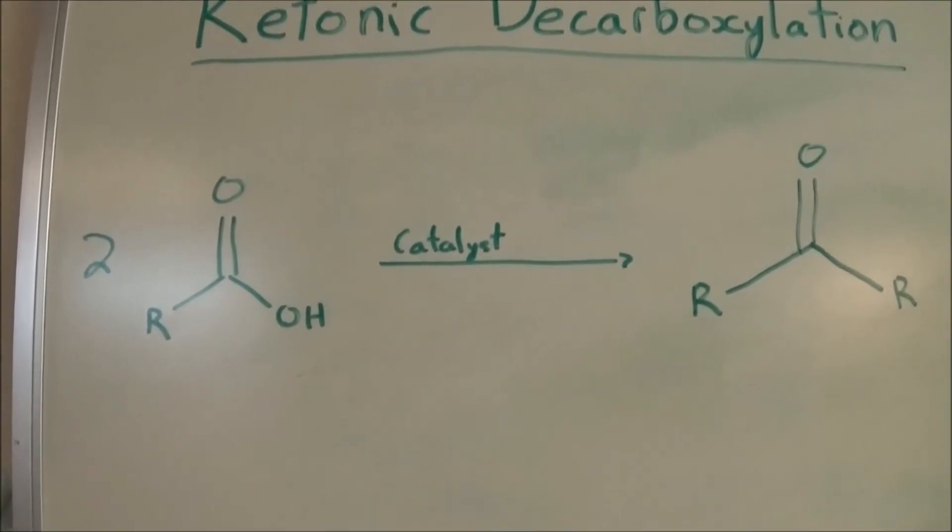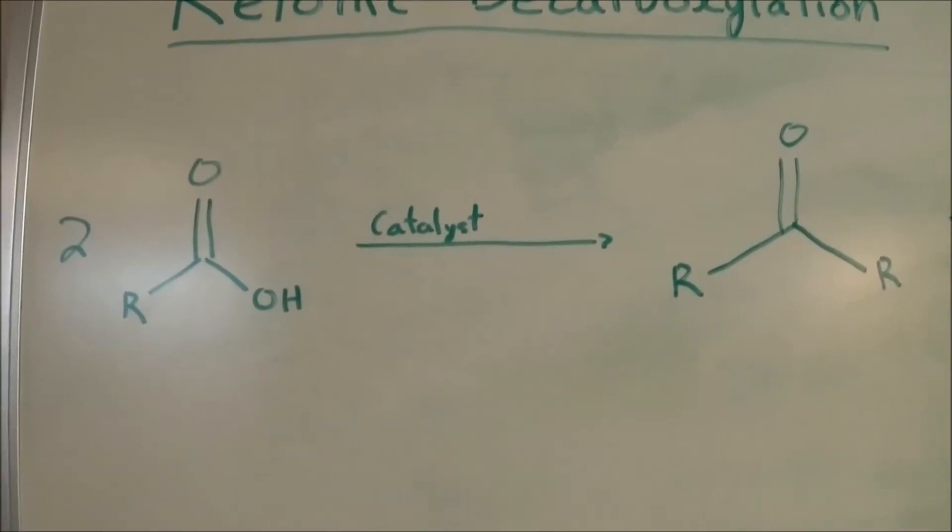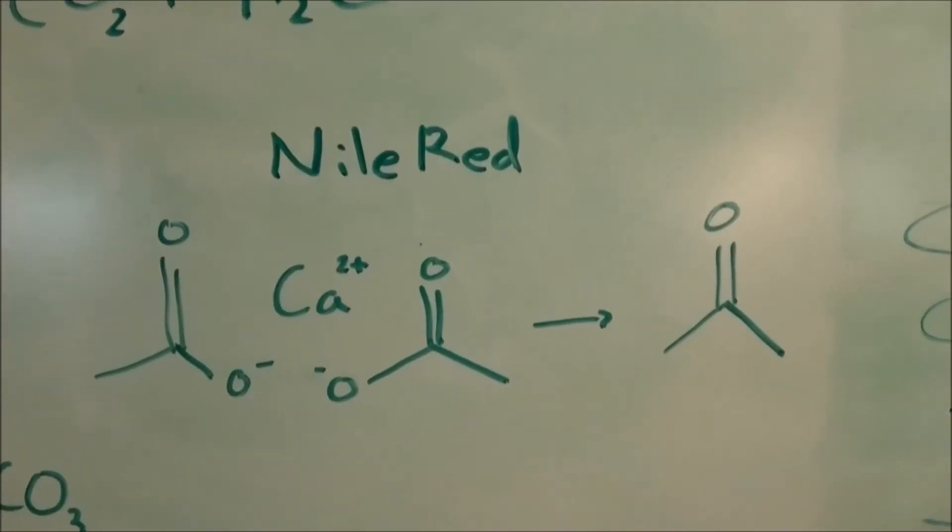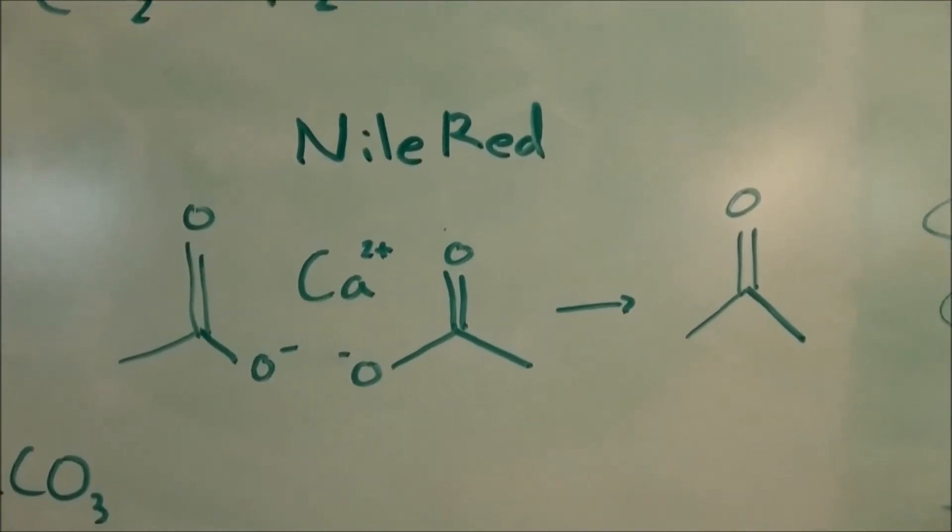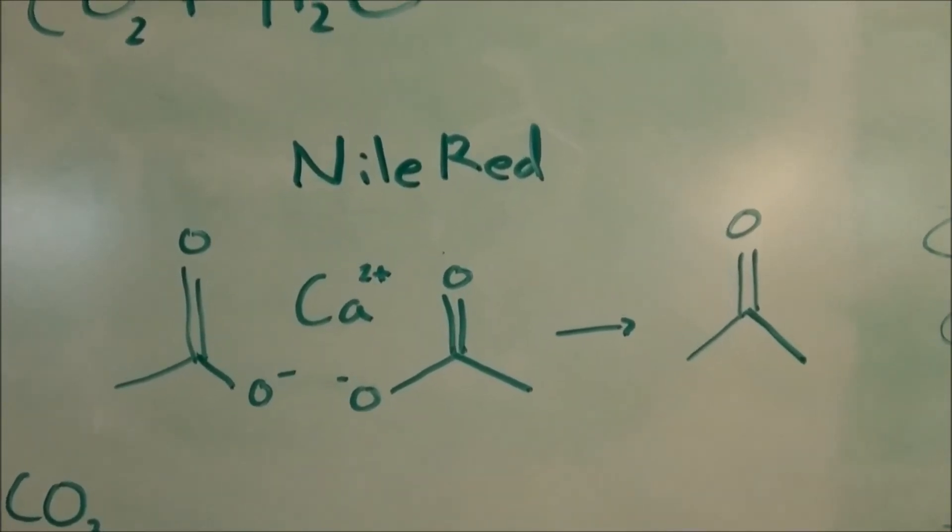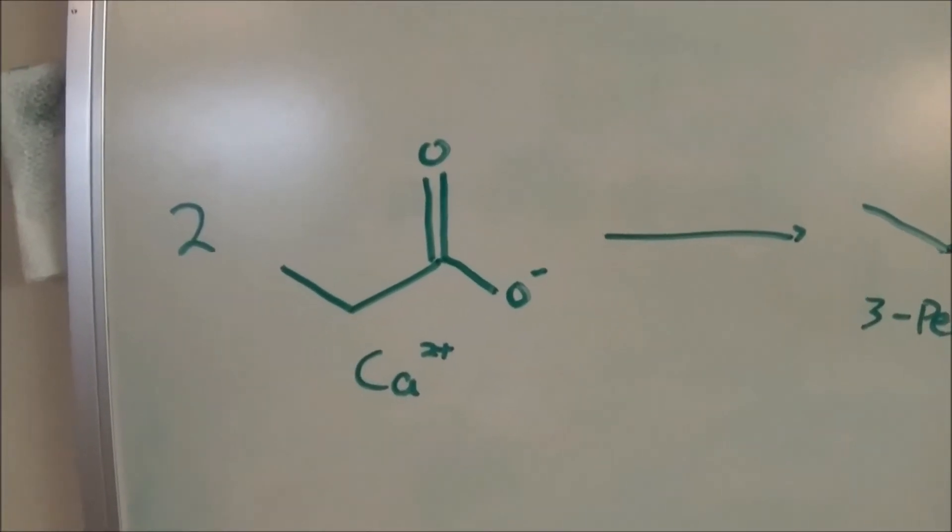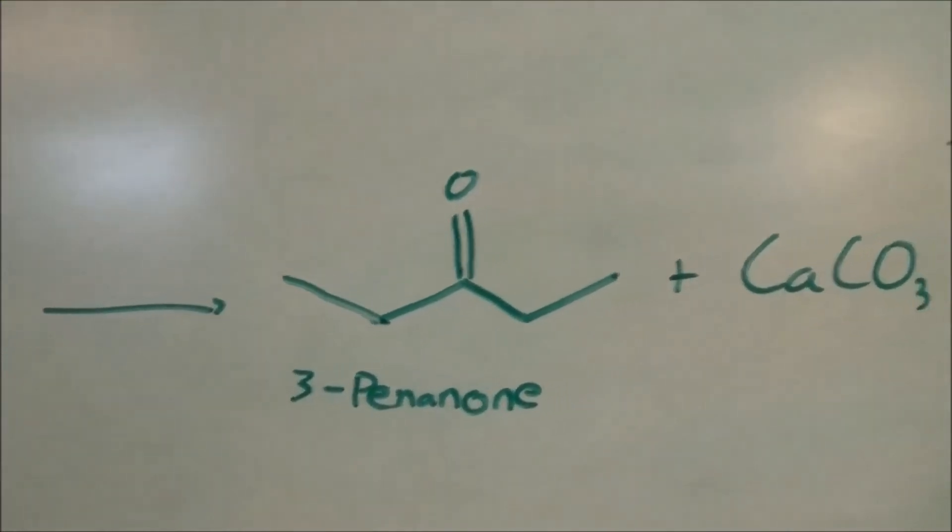It just so happens that this reaction will also take place with the salts of carboxylic acids. I believe this happens with all salts but it works best with calcium and barium ones. This reaction used to be used to produce acetone in a reaction that is demonstrated by Nile Red. Today I will heat calcium propanoate to high temperatures to give three-pentanone as well as a little bit of calcium carbonate.